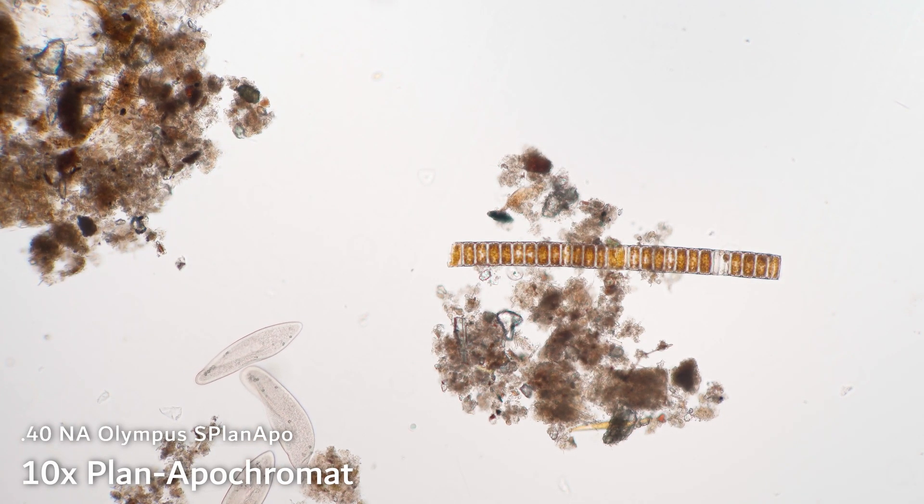This lens is going to be more or less the best you're going to get for a 160mm tube length. One more quick thing to note: there are corrections in between plan and non-plan, as well as between apochromatic and achromatic. There are semi-plan objectives, which are flat over more of the image circle than a normal achromat — usually good enough for any kind of video work you're doing. There are also semi-apochromatic lenses, more commonly referred to as FLUOR lenses — that's F-L-U-O-R, short for fluorite. It's a type of glass used for chromatic aberration control. Those still bring just red and blue to the same focus, but the green is moved in a lot closer, so they're just slightly not apochromatic.